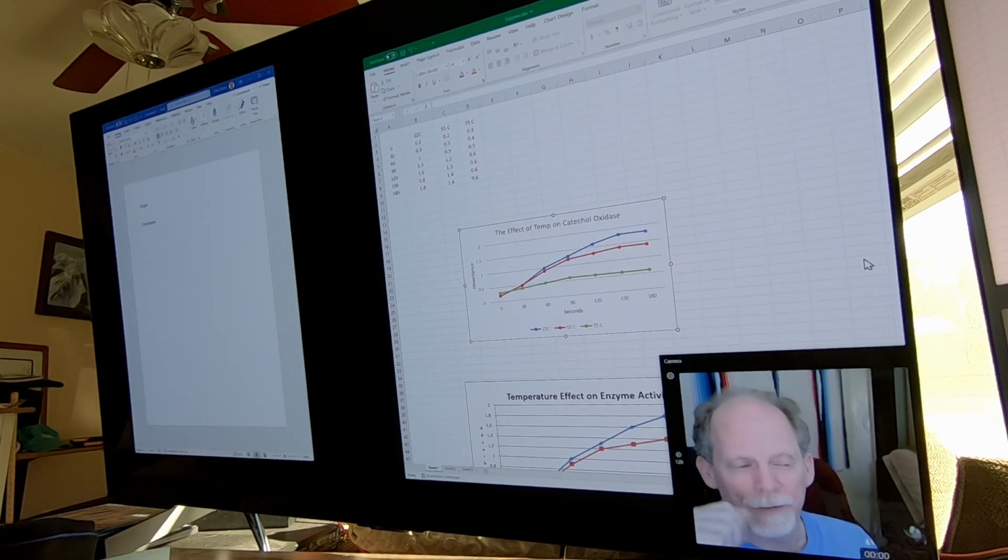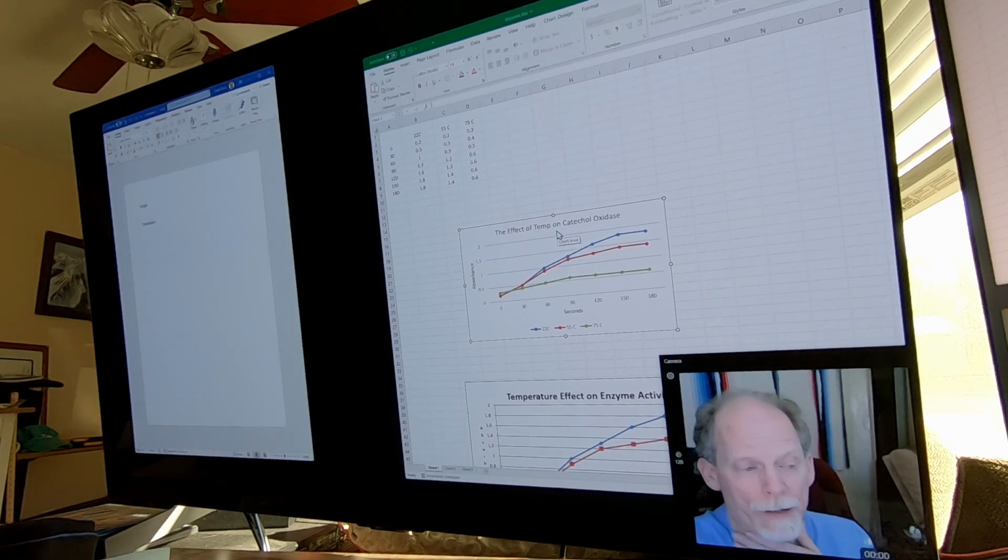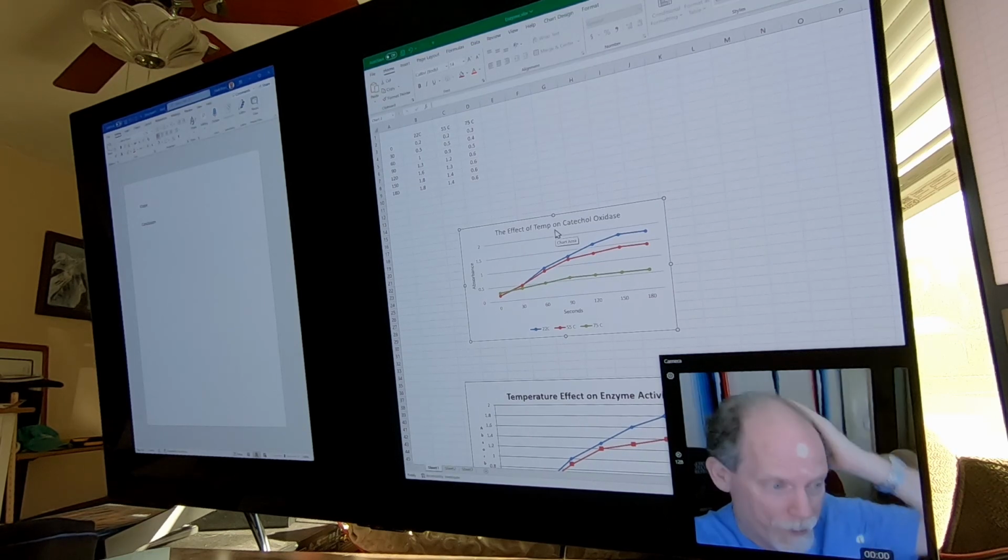Okay, hey, I'm finishing this up on my home computer, and so I've got here the graph I generated while I was in the micro lab when I did the earlier part of the video.